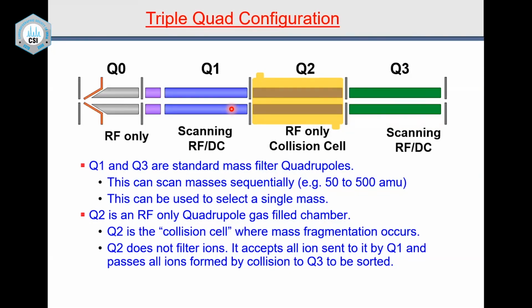And there are many things you can do with the triple quadrupole. I am touching on one or two. There are neutral losses and other applications and all that. I am not going into the details of that because triple quadrupole MS/MS is a separate lecture by itself. That requires some competent people who have done a lot of work on that. If they are bioanalytical, we have to bring out some bioanalytical people and talk to you about how the triple quadrupole is used on that. And they will give you all the details of that, and we will definitely arrange some talk on how to do that.